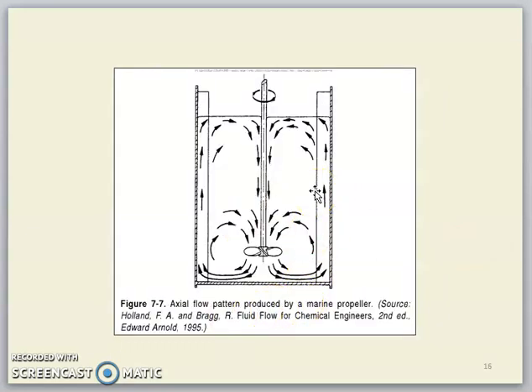This is the axial flow pattern that is produced by a marine propeller. Okay, axial, you can see here from bottom to top, and return back to the bottom of the vessel.